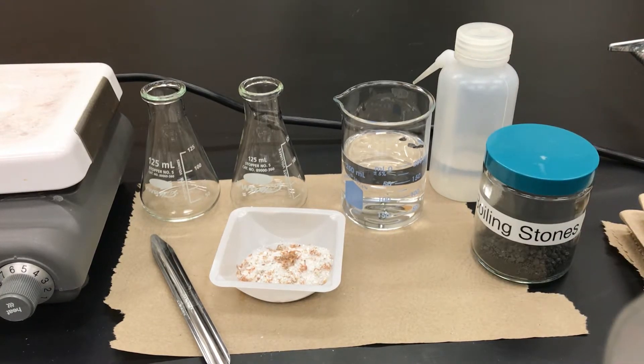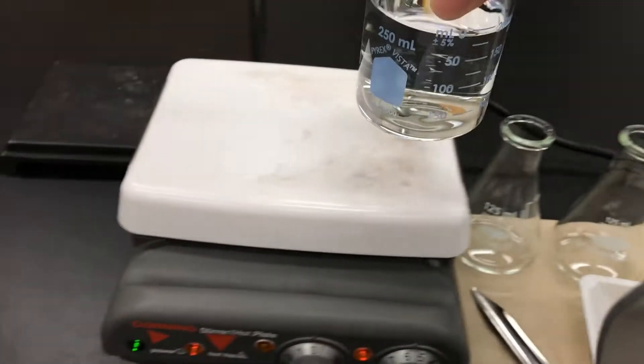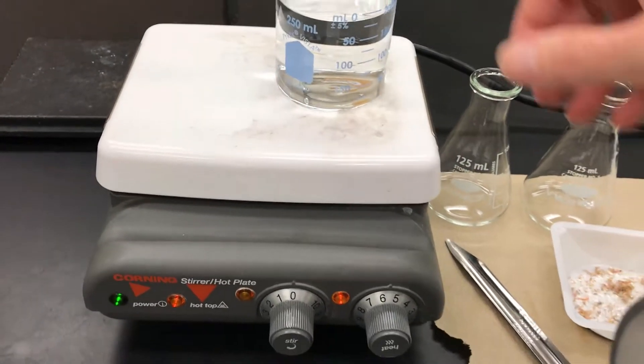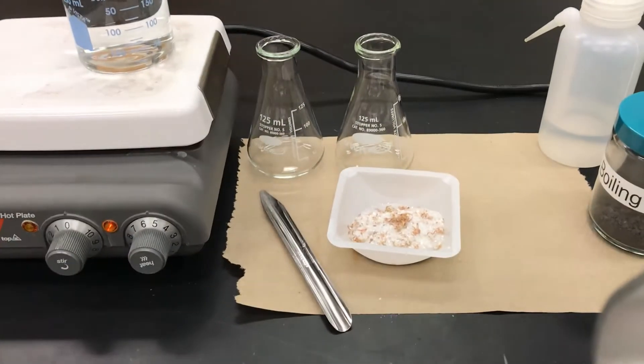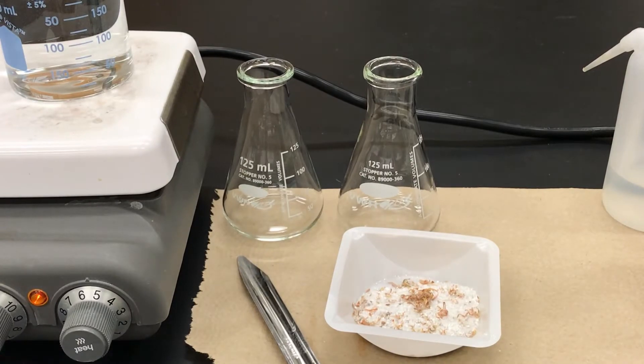Boiling stones are little pieces of rock that help you have a smooth controlled boil. They are places where the bubbles can start, and so it prevents there from being any bumps or large boiling explosions that might happen.